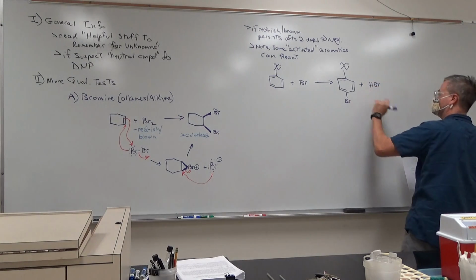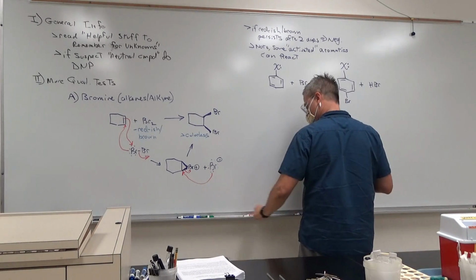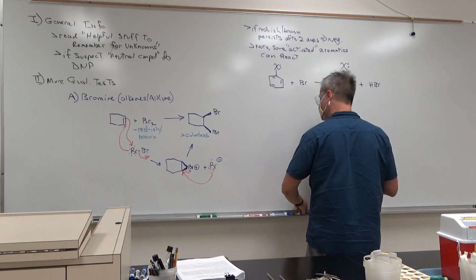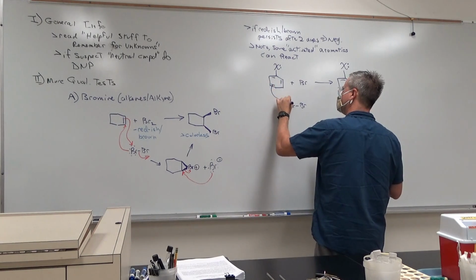HBr, that's the key product that you detect. Okay. Similar type of mechanism, at least for parts.